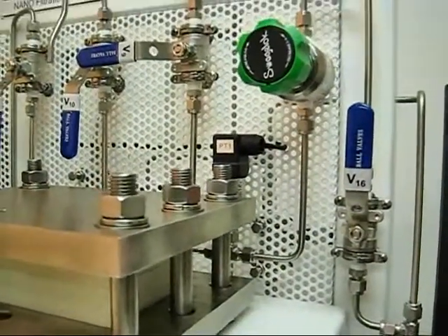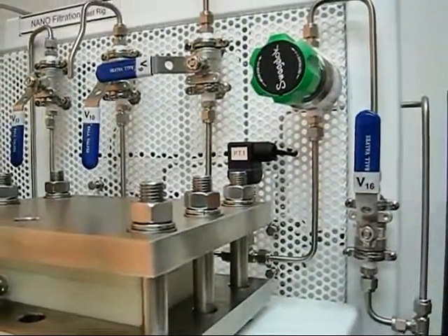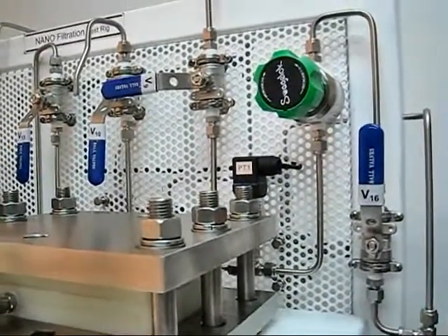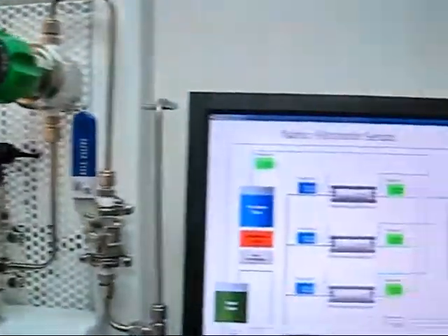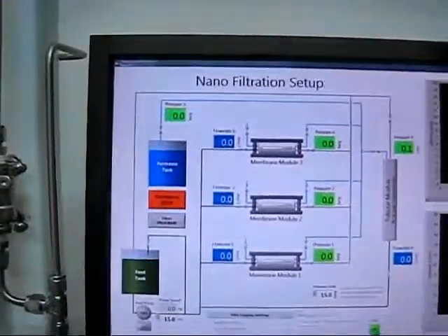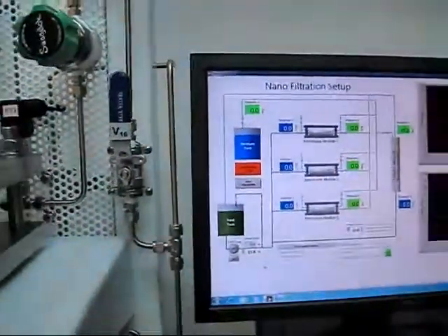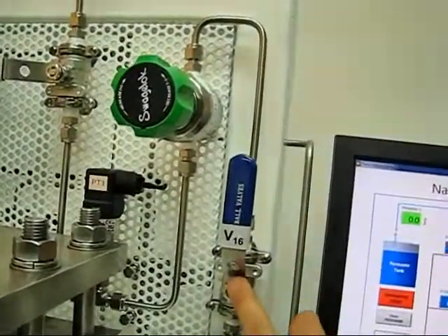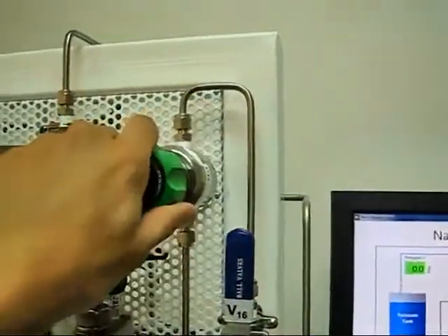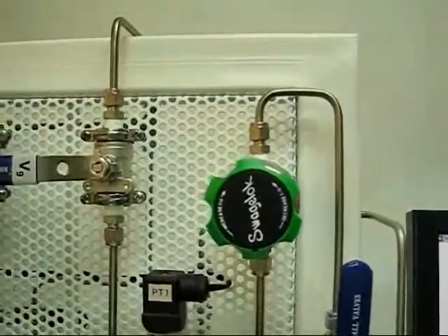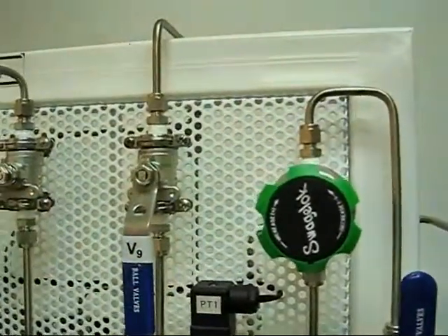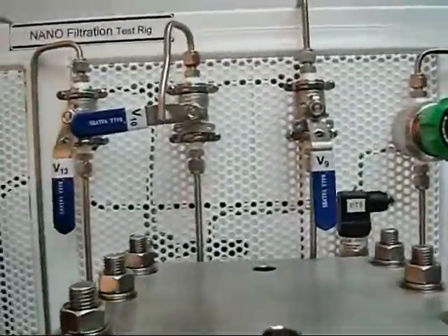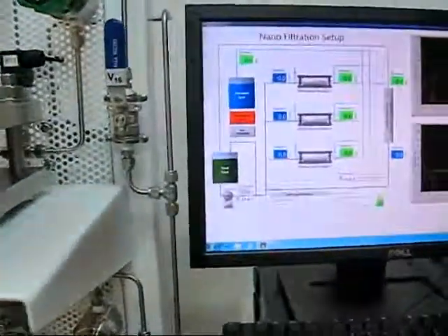As we're planning our next experiment with a higher flow rate, maybe 8.5 liters per minute with a back pressure of 10 bar, I've reset this valve over here to fully open. We can either shut this and open this, or the other way around. The feed bar is now fully open.